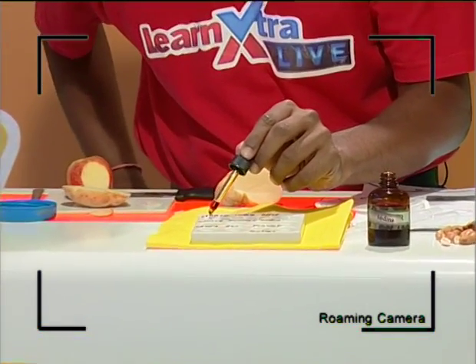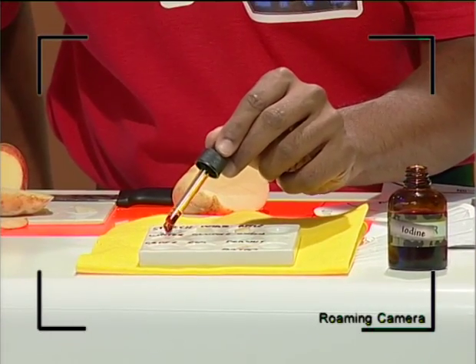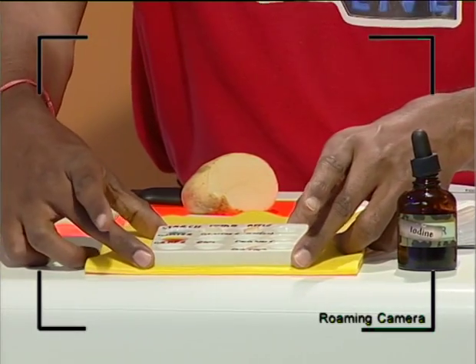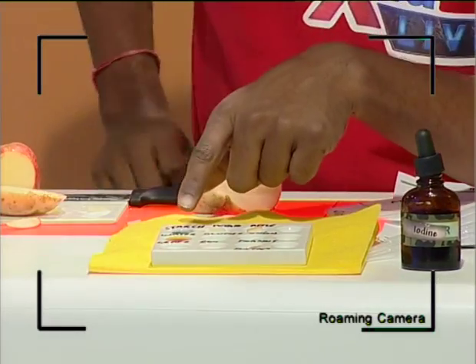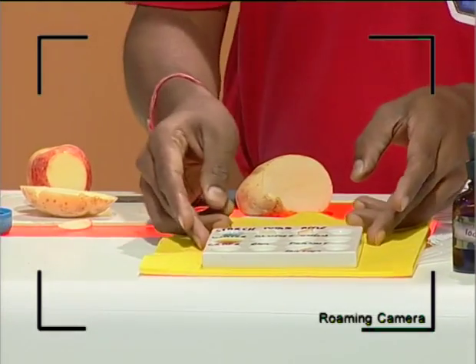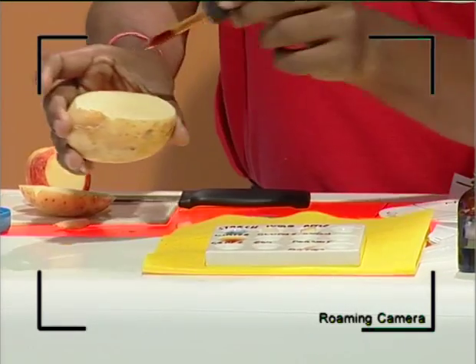So that's our positive control, and I'm just going to add a drop in the positive control and the negative control. I'm going to lift this up slightly, guys, and I'm sure you can see from home. Here we have starch. In the presence of starch, a substance will, if you look at this, guys, I'm going to try this on here, on the potato.